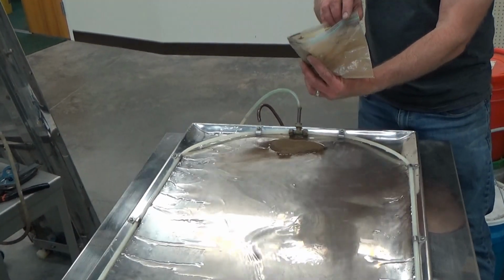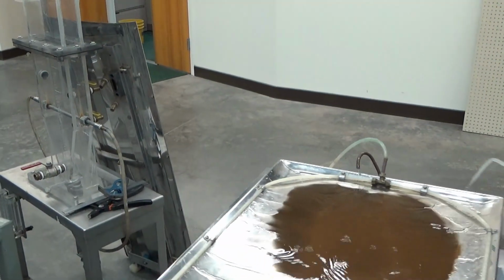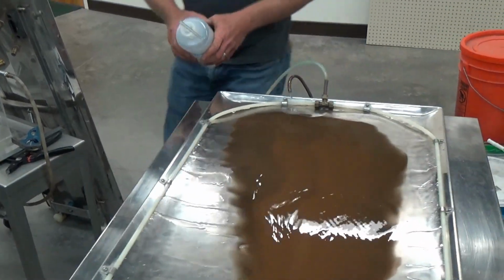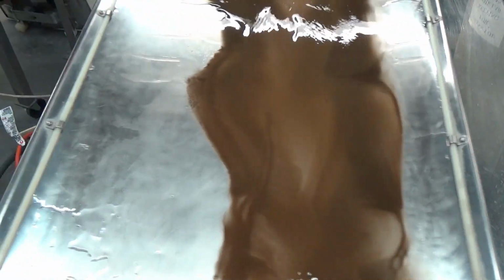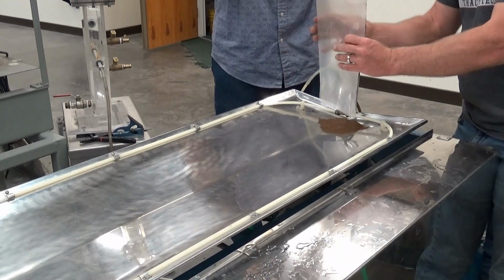Now this is a Mosley table. As you can see, this is not a high production unit here. Laboratory scale. Oh, you know what's wrong? I'm sorry. Totally screwed this up. So this is Montana B that was run through Jimmy's impact mill there that we were testing yesterday.